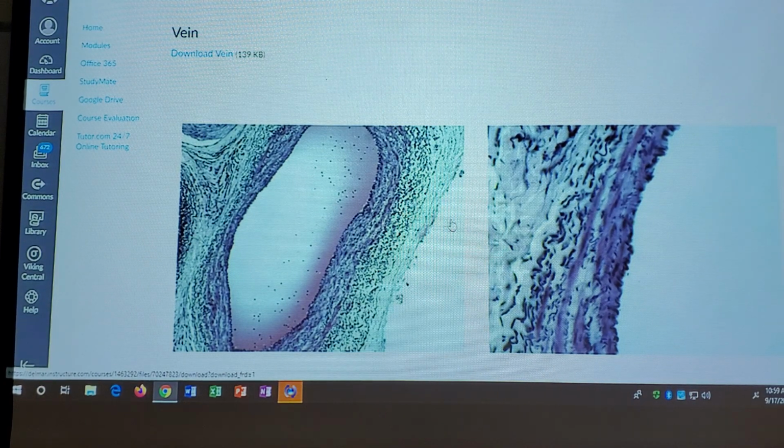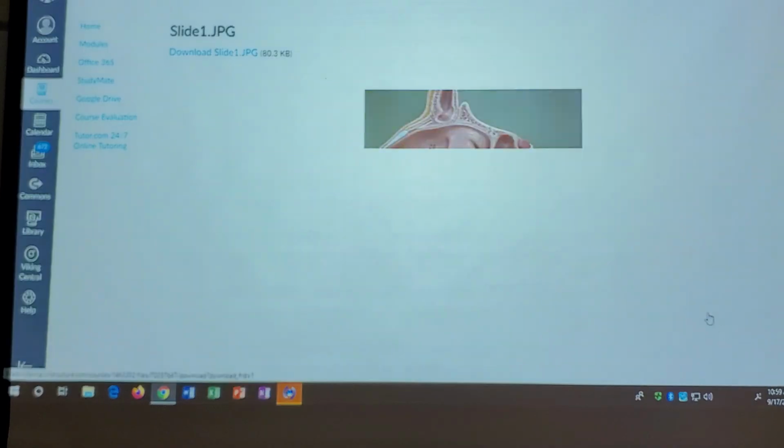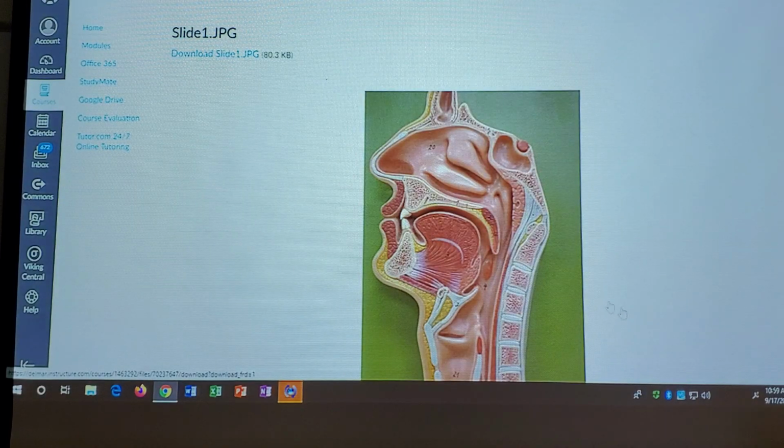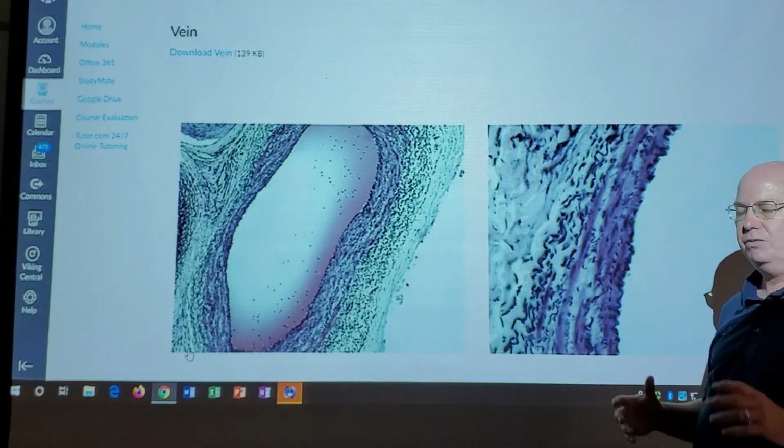If we cut a little section out here and looked at it, this would be your lumen, here. All right? You can even see a bunch of white blood cells in here with all these little red blood cells. And I believe that concludes the slides that I want you to see. So let me go back just so that you're not staring at something that we're not doing.